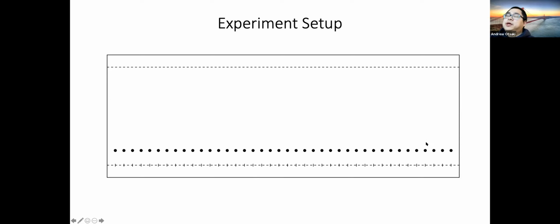I call it a plate because it just looks like a plate. If you ever use thin layer chromatography, we call them plates because they have a surface that's white and an aluminum bottom. That's why we call them plates. But here it's just a paper. So just a piece of paper right here.